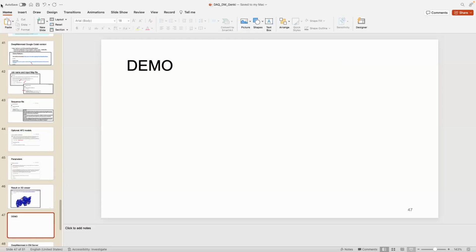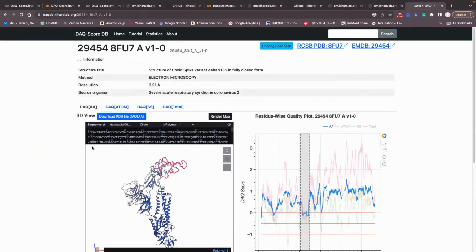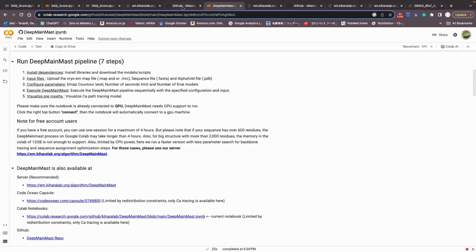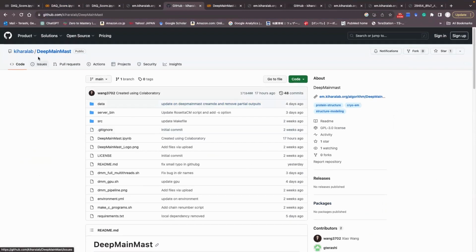Okay, let's do the demo. First, please access the DeepMainmast GitHub page.